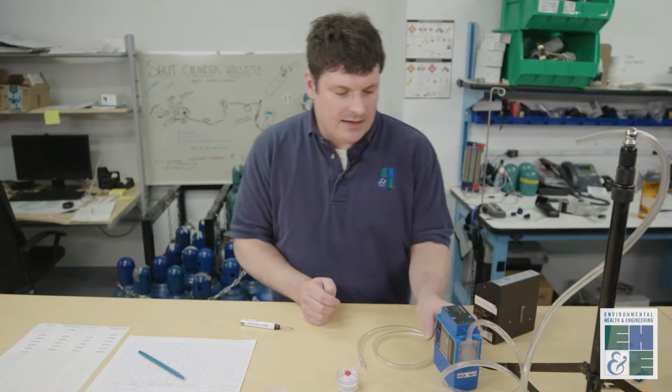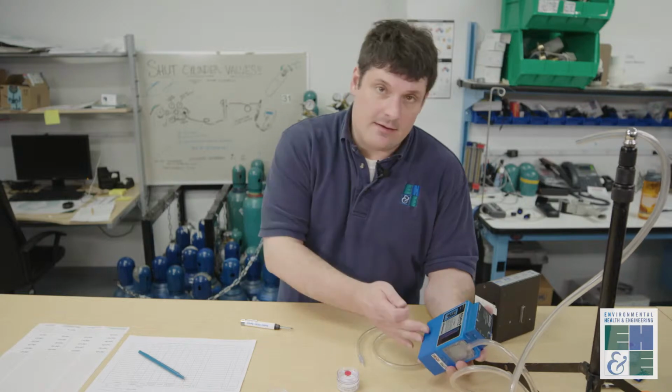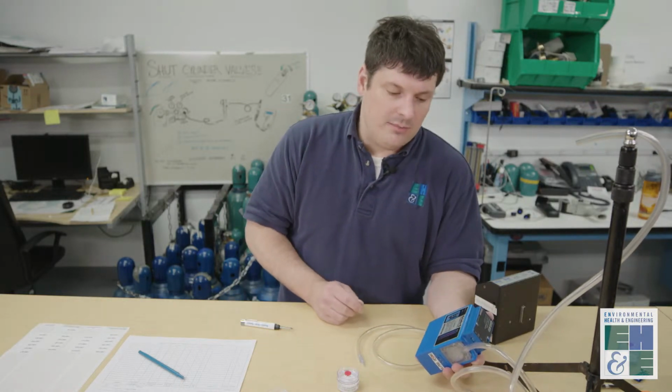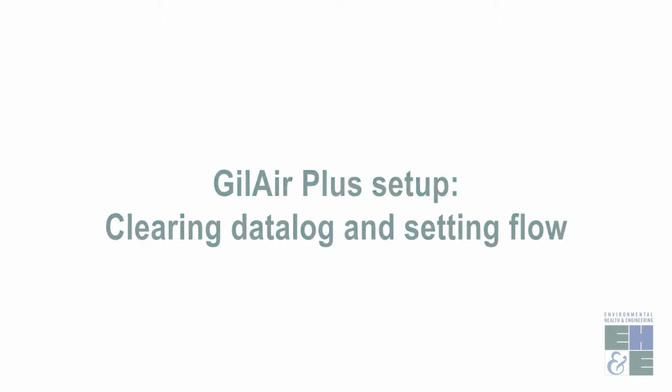So we begin by having our pump. These are battery operated and need to be charged before use. They can also be operated plugged in if the sample duration is long.